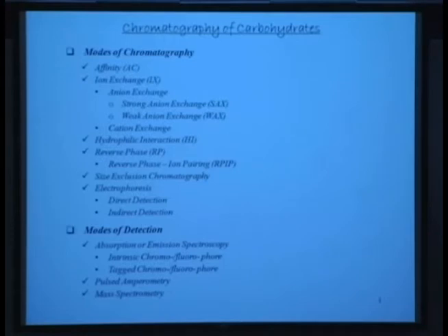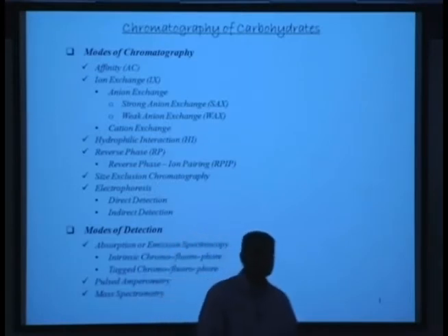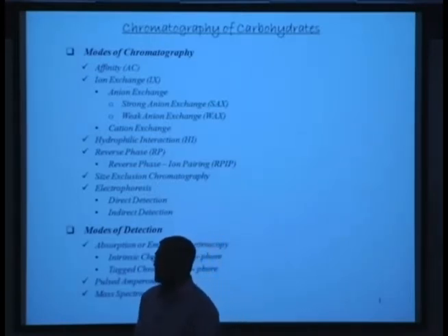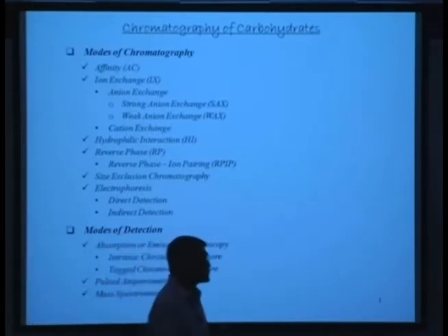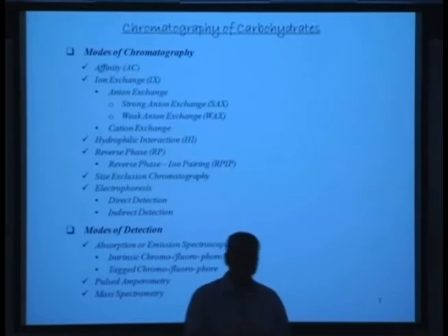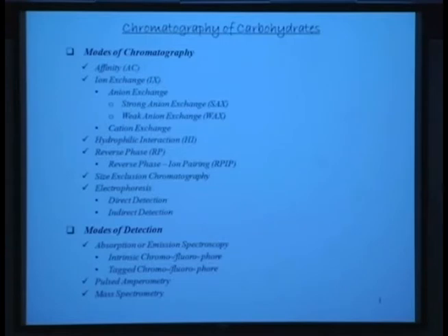So these are the two major classes, and much of what chromatography is about is understanding the structure of glycans so that we can choose an appropriate technique for resolving and for purifying these glycans. So if you really look at what techniques have been developed from the point of view of chromatography, this is what we have. We have several techniques that have been utilized.